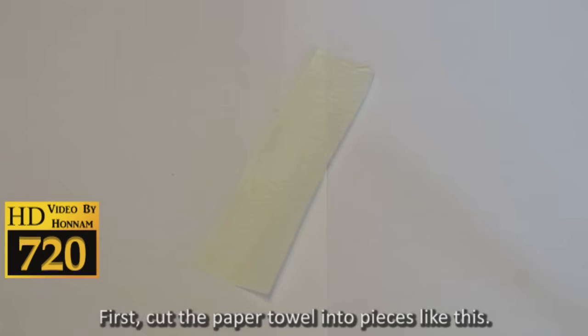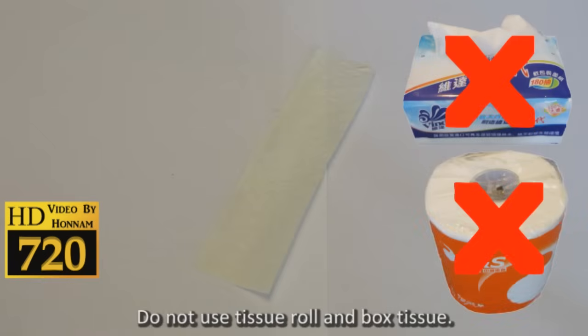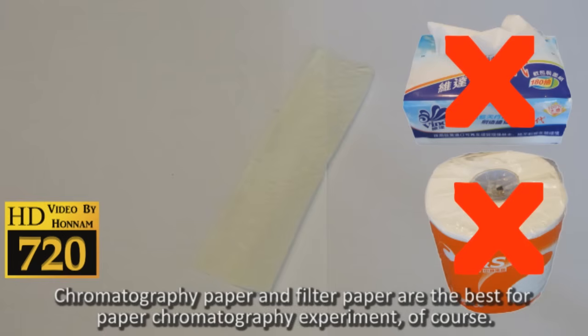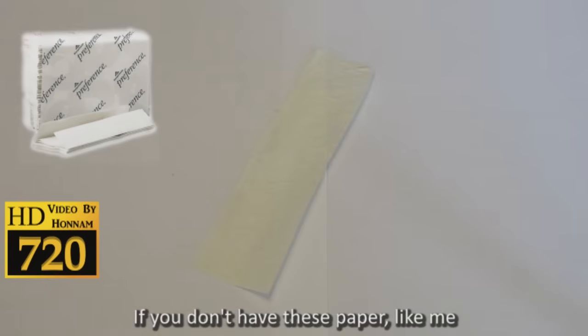Do not use tissue roll and box tissue. Chromatography paper and filter paper are the best for paper chromatography experiments. Of course, if you don't have these papers like me, you can use white multi-fold towel paper because it is thicker than normal tissue paper.